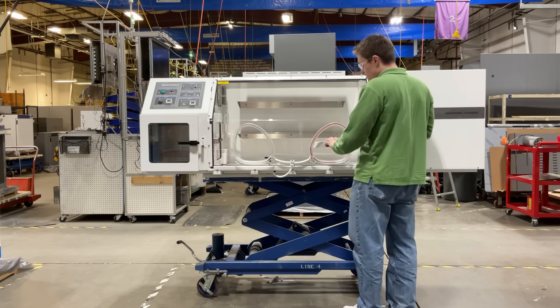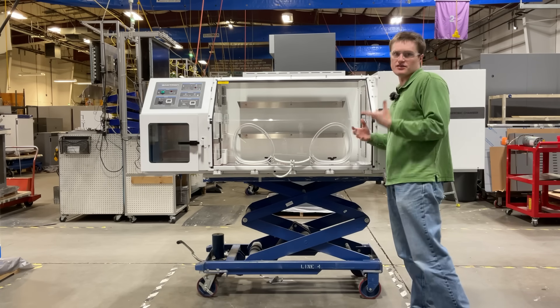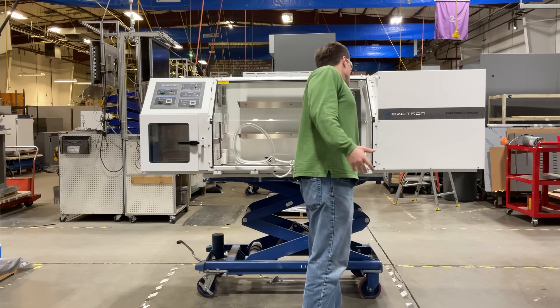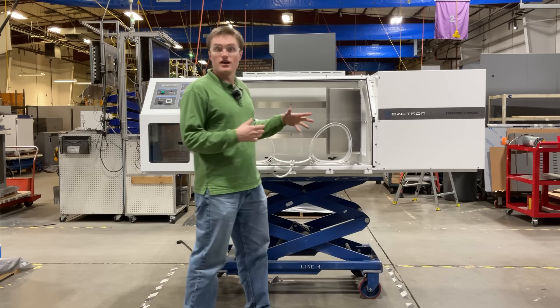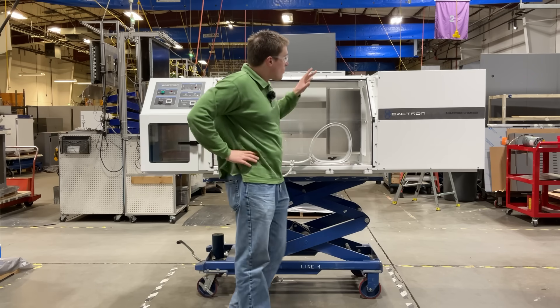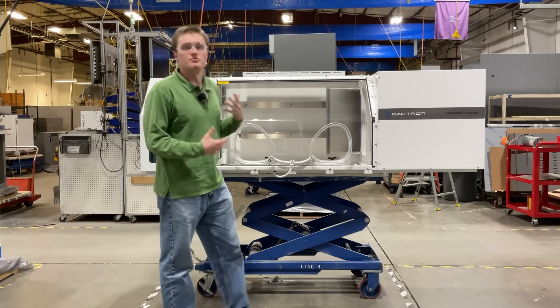Moving on, located in the center, we have two spacious shelves to allow you to mount anything that you would like. Then, on the right, we have the large 600 petri dish incubator. The Bactron 300 has a 300 petri dish incubator located in the middle, whereas this one is on the side. The control is the exact same, just with bigger capacity.